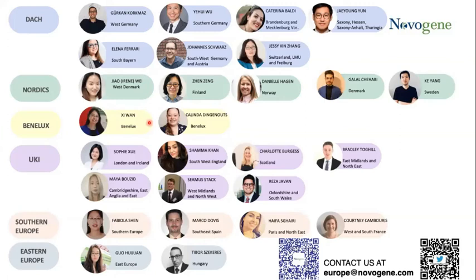Thank you. Miguel Ligon has asked, he has some samples with only a few picograms of DNA, and they'd like to know the bacterial structure. Can we sequence that small an amount? And what kind of service should I send the order to?